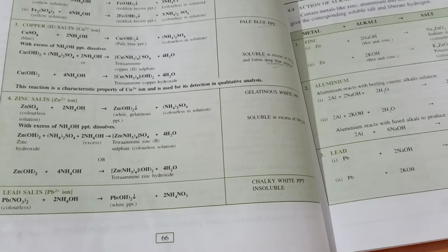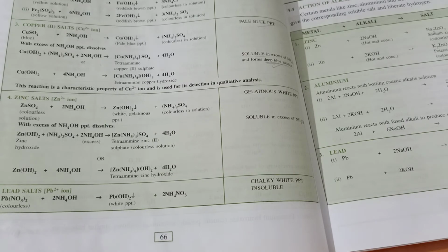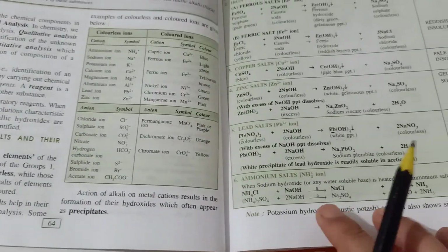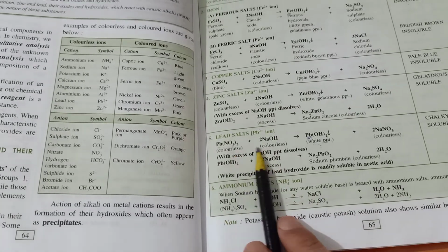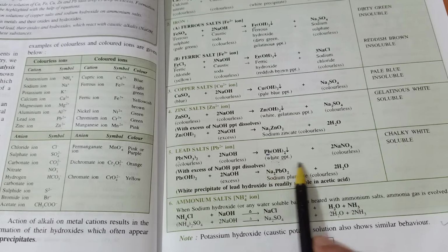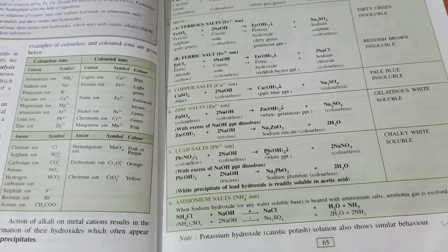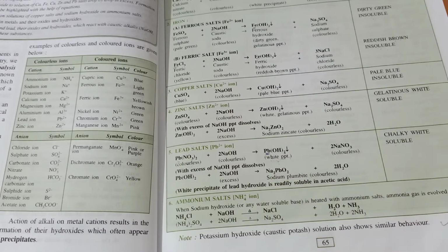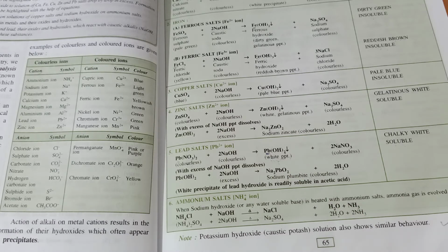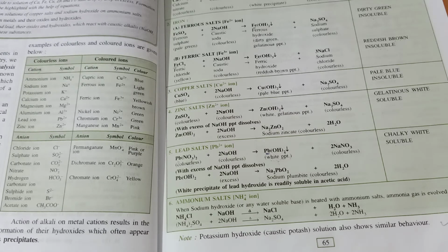It remains insoluble. But in the case of sodium hydroxide, this white precipitate of lead hydroxide was soluble in excess sodium hydroxide. So this reaction can also be used to distinguish between sodium hydroxide and ammonium hydroxide.